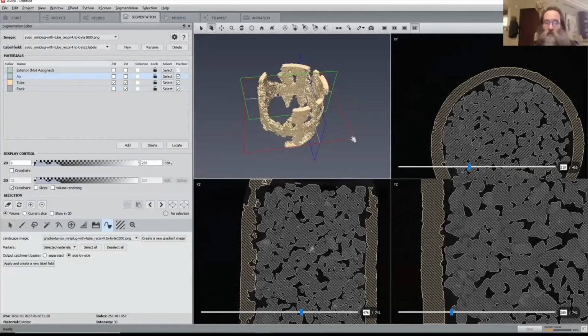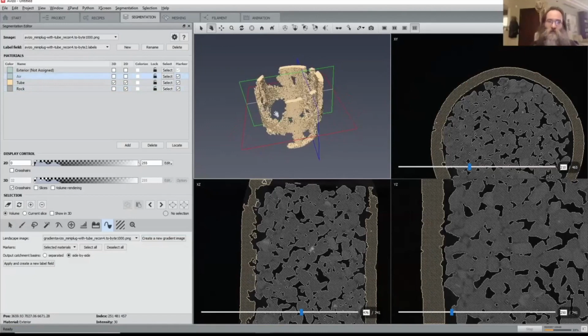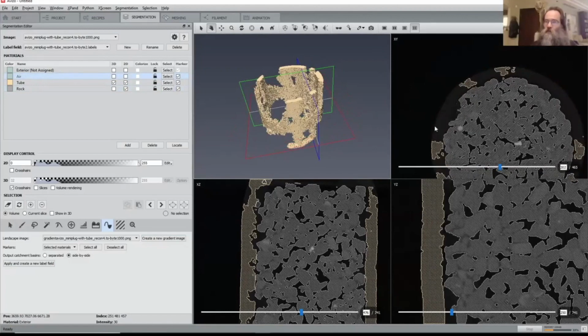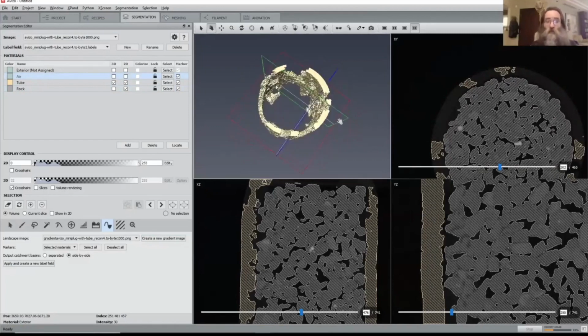That's what it looks like. And you see it's not perfect. Of course, we're missing things. So the way to fix this is now to go to those slices where there's nothing there and paint a few things again and go through that a few times until you have the whole tube. And if you look at it inside, it's really only the tube now.